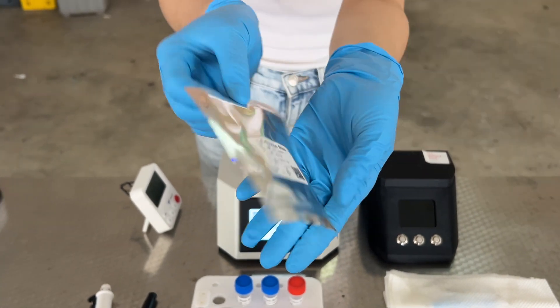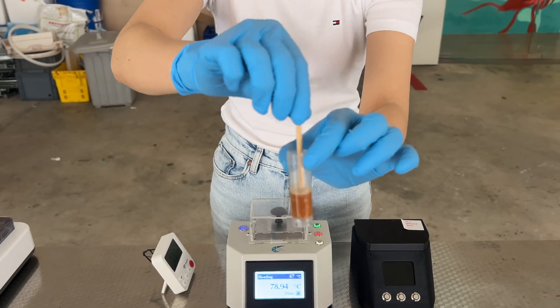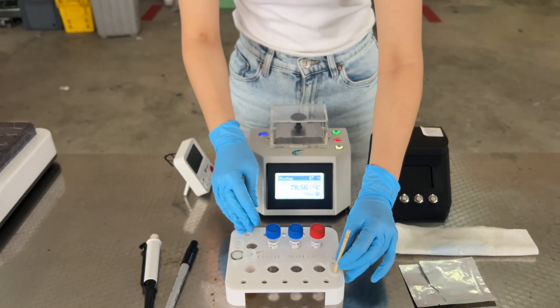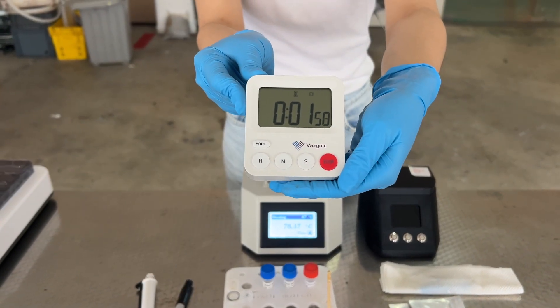Prepare the extraction stick. Insert the white portion of the extraction stick into the lysis buffer and stir lightly for 12 seconds. Let the stick stand for 2 minutes for DNA binding. Ensure you don't touch the white portion of the stick.